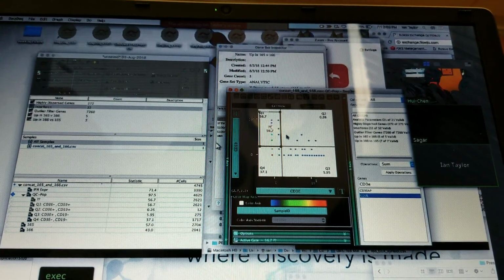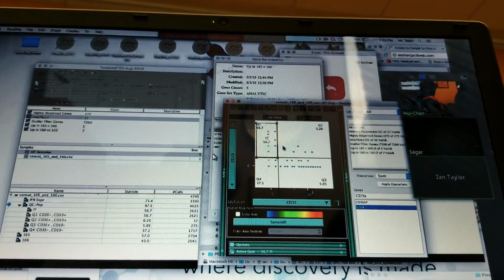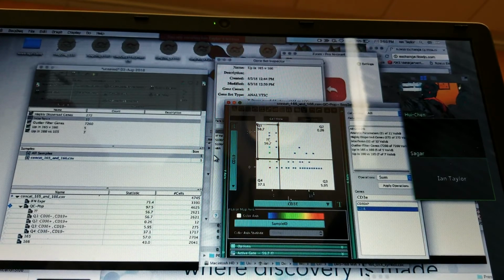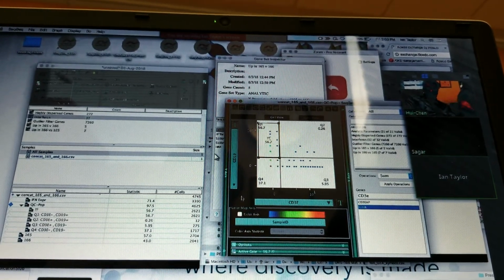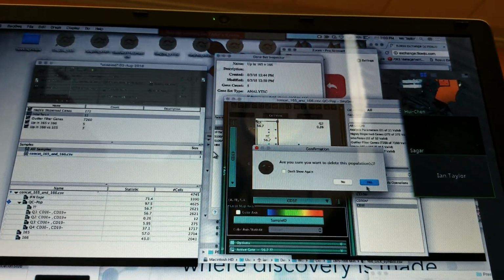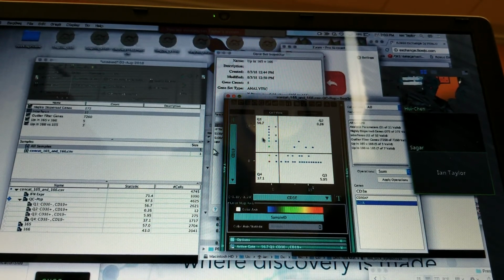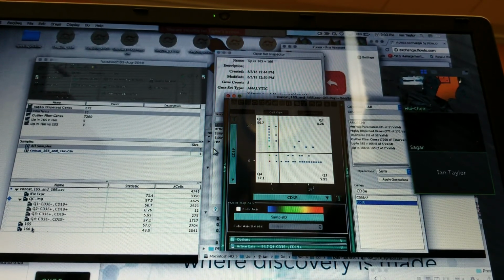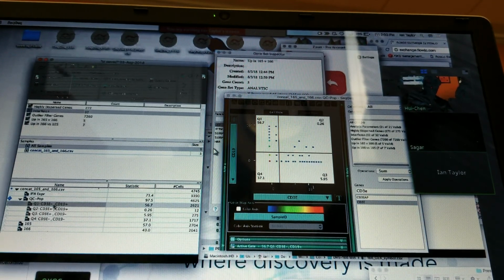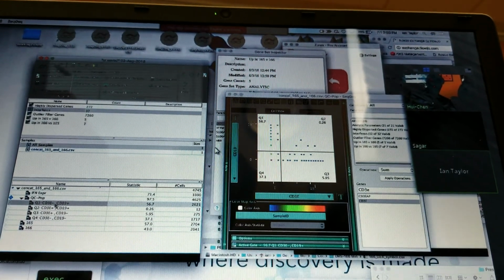Of course, the genes themselves are a little bit independent of these gates, with the exception of CD19 and CD3, because obviously those are the genes that we're utilizing here to do this gating. But if we want to get into GeneView, then we need to have a set of populations that we're interested in. In this case, maybe we'd be interested in CD19. So if I am interested in CD19, something I often do is look at the differential expression of CD19 positive cells relative to the rest of the data.